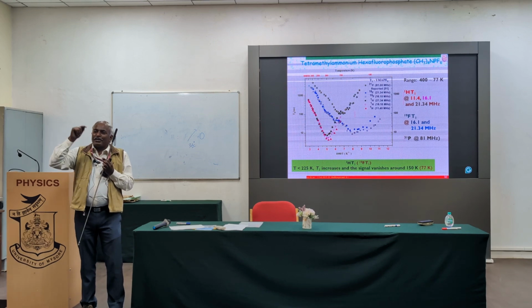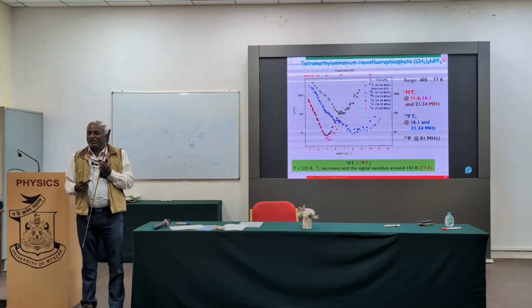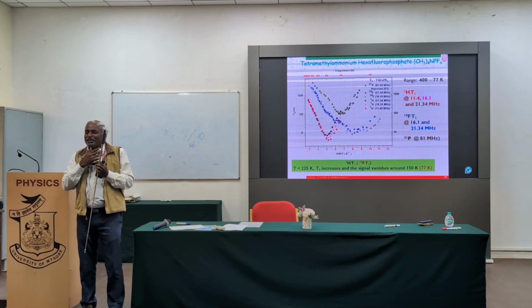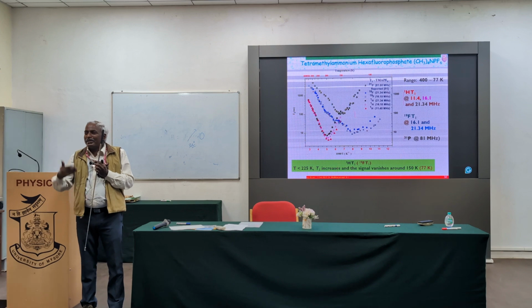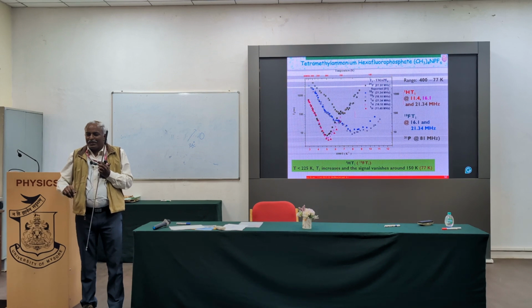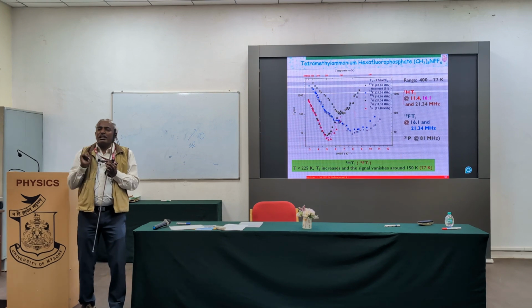We recorded the spectrum for the Teflon tape which was wound around the sample. That motivated us to do this entire fluorine NMR. Till then it was not on our list to do, and in our lab we never explored that fluorine NMR can be done on the spectrometer. From the proton NMR spectrometer only, you can do fluorine? Yes, same spectrometer. Fluorine also has a spin-half nucleus, only the gamma value is slightly different.